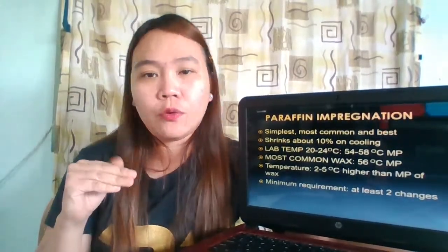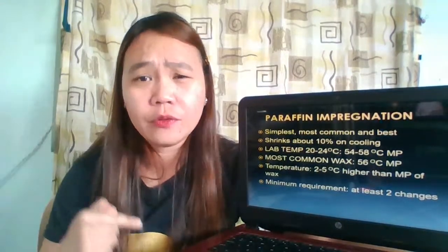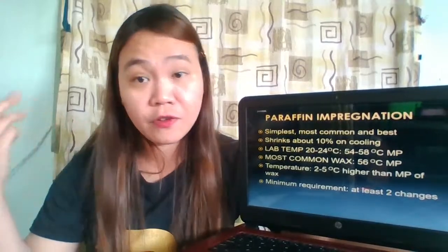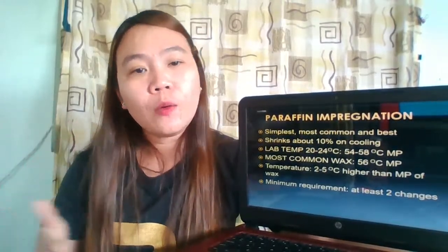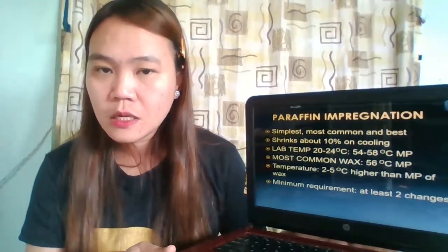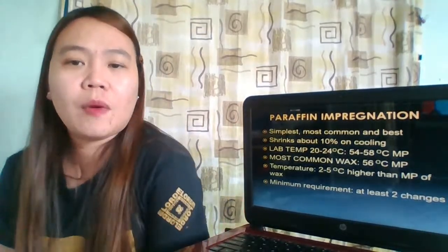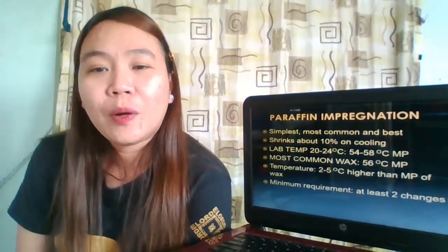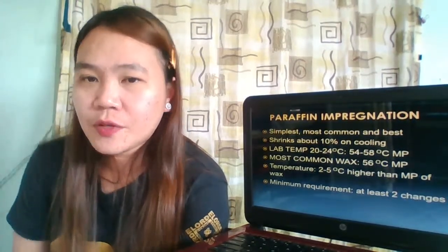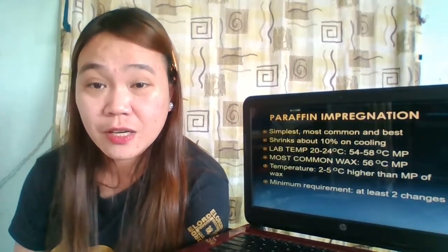What is one thing that you have to remember when it comes to paraffin or waxes? Remember when we were talking about dehydration, the one factor that you have to consider would be concentration.